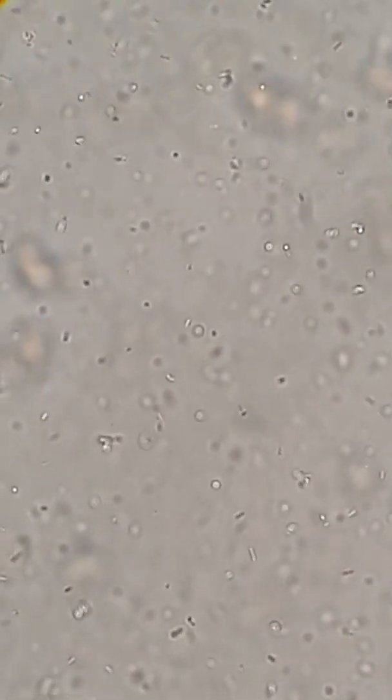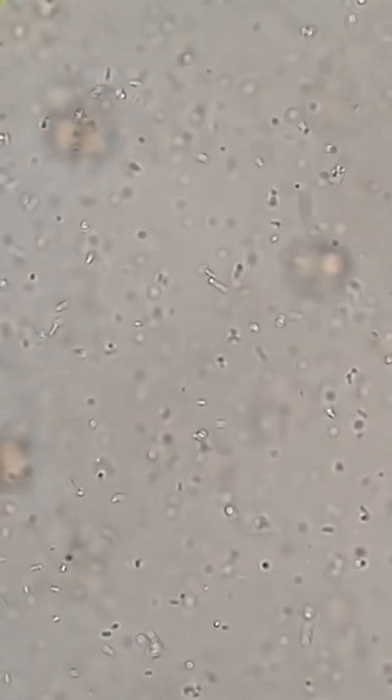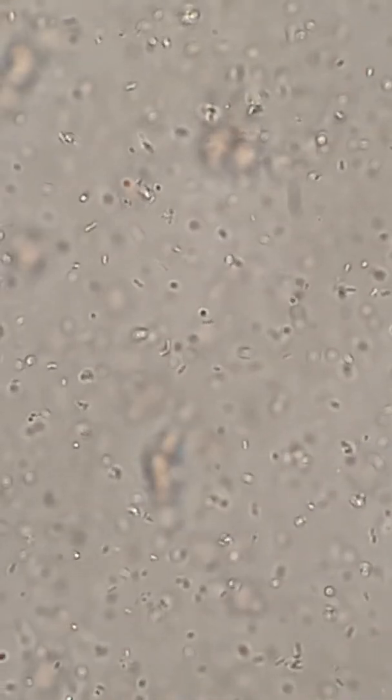This is not even me moving around. I mean, you're looking at one single drop at... oh, I forgot to tell you the magnification. We're at total 600, so you're seeing these bacteria 600 times larger than what they actually are.